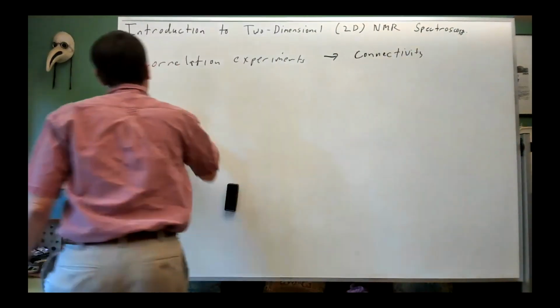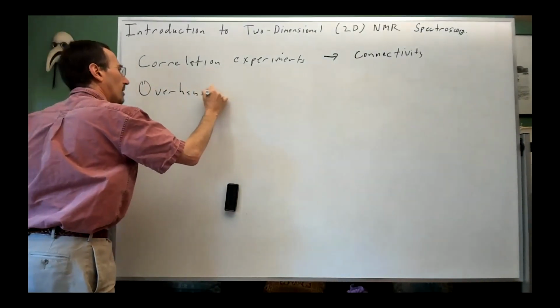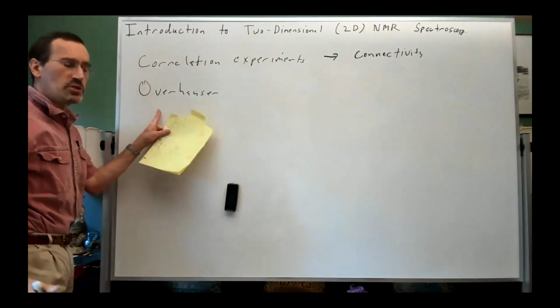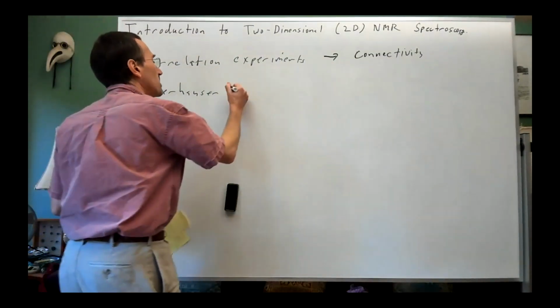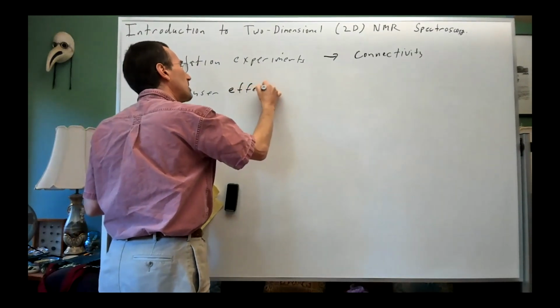And then there are Overhauser effect experiments. And there are also one-dimensional Overhauser effect experiments. We'll talk about them in a lecture or so. I think it's next lecture.